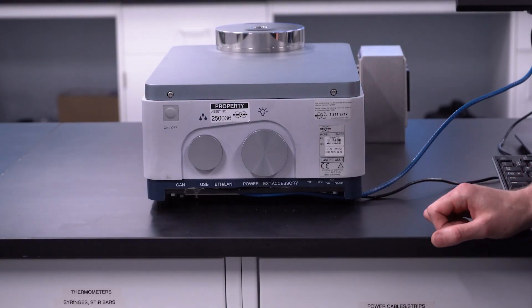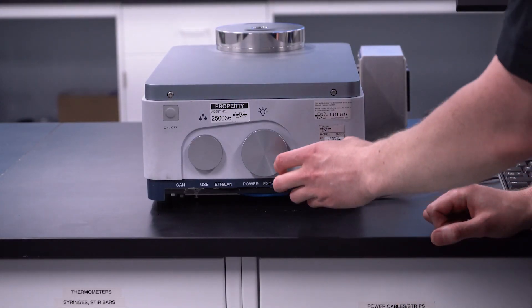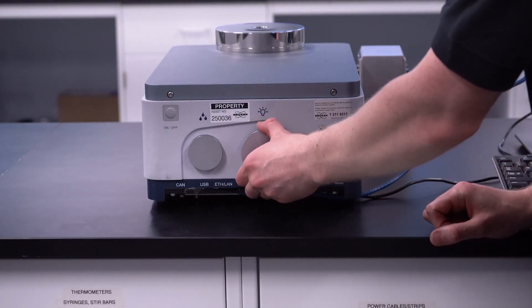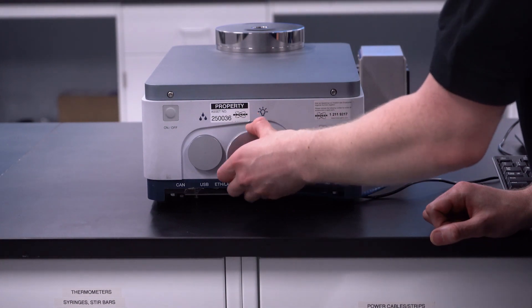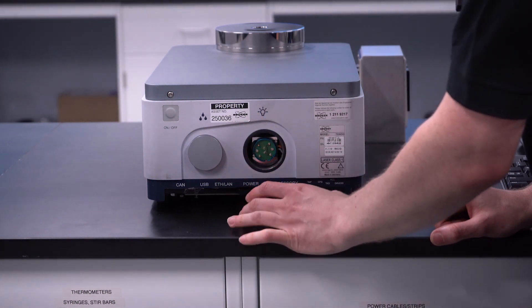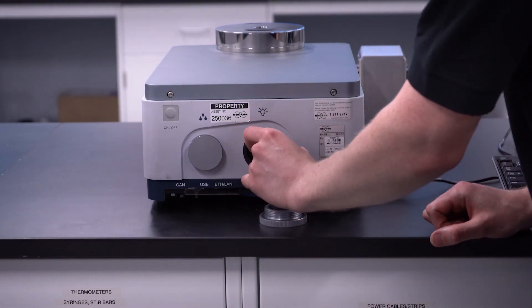The Tango light source is easy to replace as unscrewing this cap and pulling out the light source.